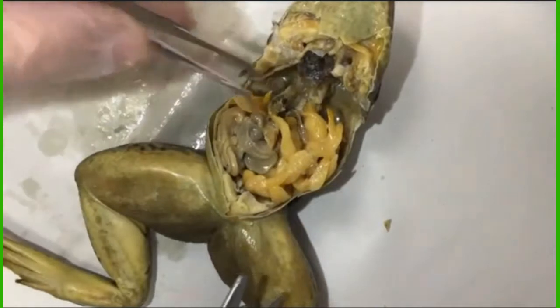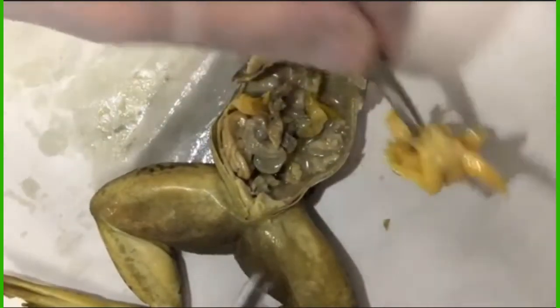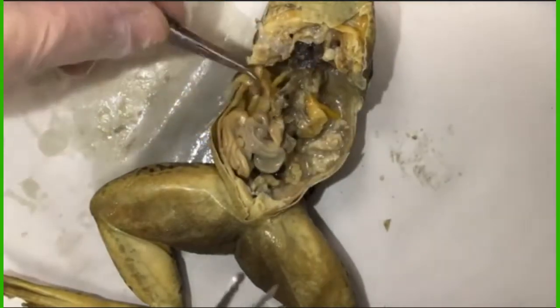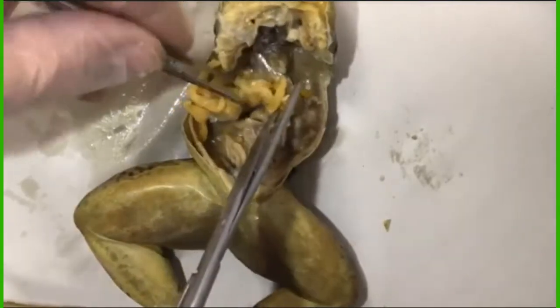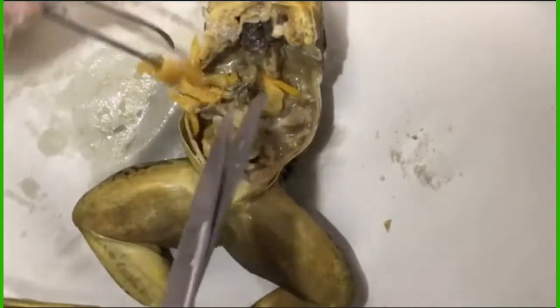Those are fat bodies. The yellow, noodly looking structures there are fat bodies. Now the frog stores fat, right? Especially females, before they get ready to come into condition to lay eggs. They store a lot of fat because it takes a lot of energy producing all those eggs. So you see the fat bodies pretty prevalent, especially in females. And I'm guessing this is a female at this point. Of course, we're going to find out in a little bit here.